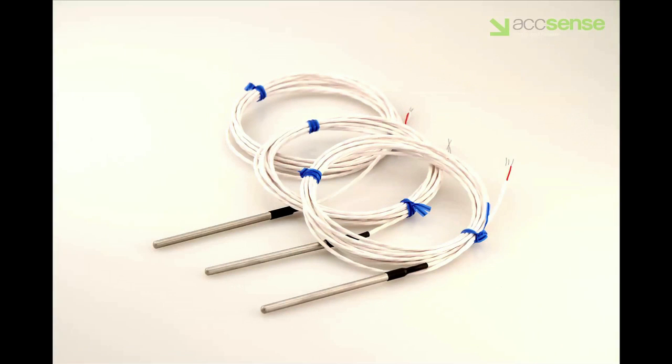This is the RTD probe, normally used in refrigerators or freezers. Its range is from minus 100 to plus 100 degrees Celsius.